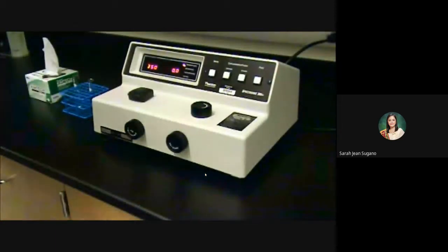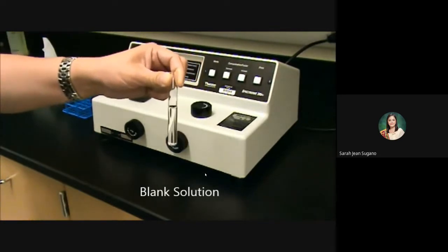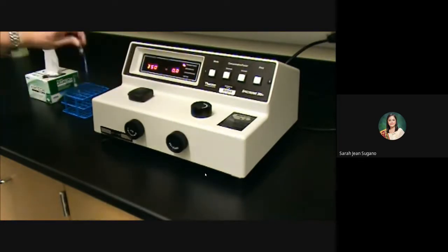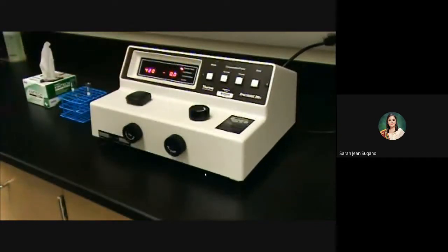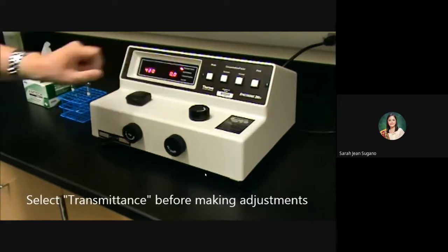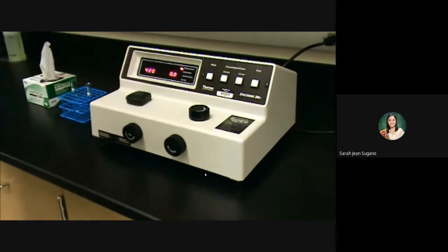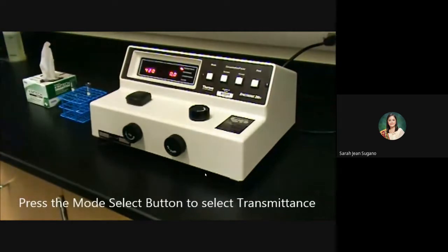To begin using the spectrophotometer, you have to have your samples ready. So first, you should prepare a blank solution. The blank solution has everything in it except for the molecule or compound you wish to measure. Then you should also have a tube which contains a sample which you want to measure. When taking readings, it's best to use the transmittance as the way to set up the machine and also to take your readings. The transmittance scale is linear, so it's easy to set the 0 and the 100%. So when you're ready to calibrate the machine, be sure to push the mode button several times until you have the transmittance value highlighted before you begin.